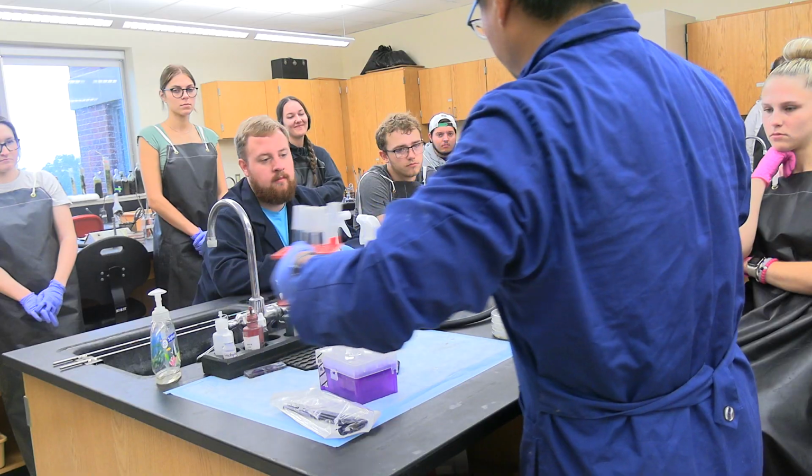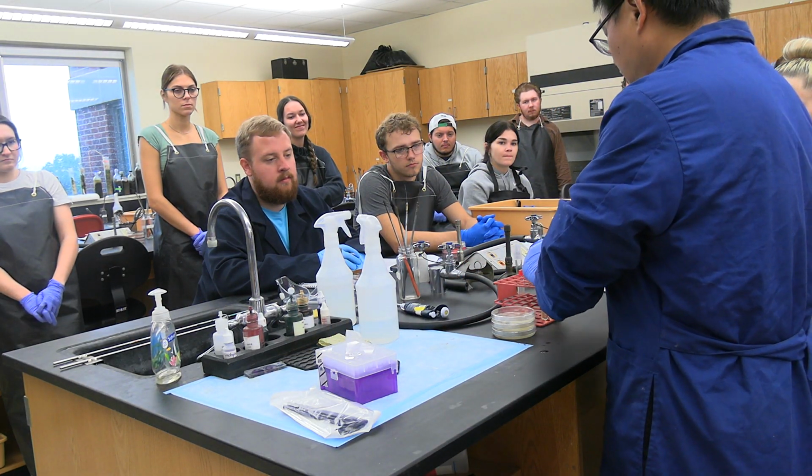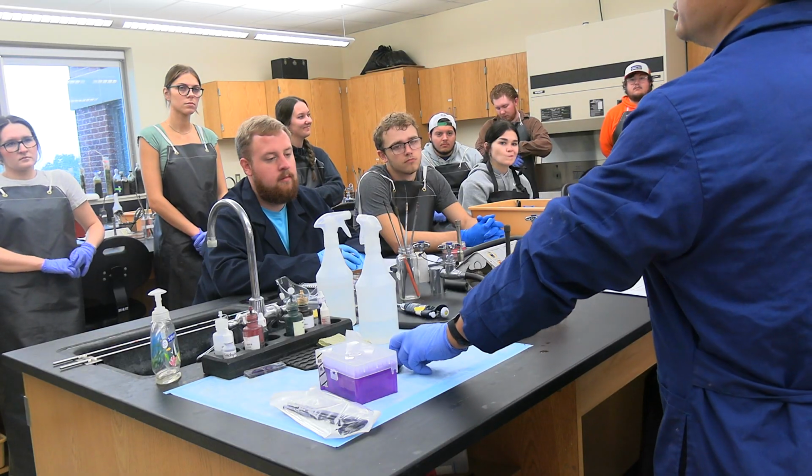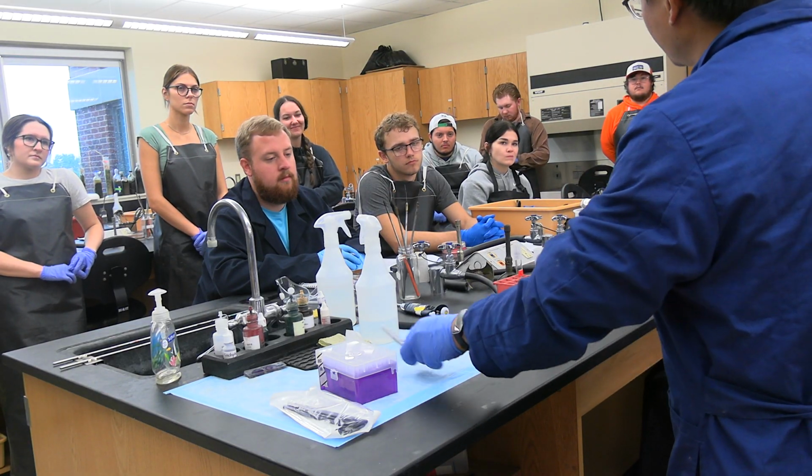It's the same thing for the tubes. The first time you do it, I don't know whether you're going to label them. You can label your tubes if you're not familiar with the dilution factor.